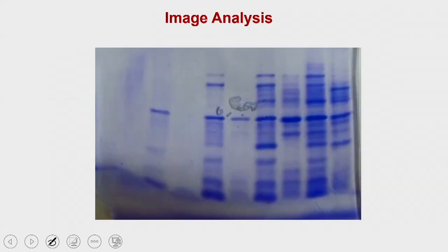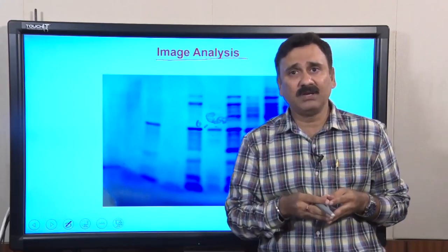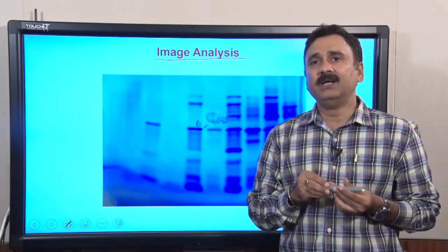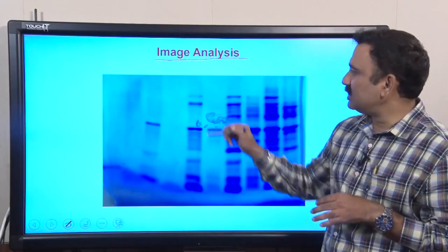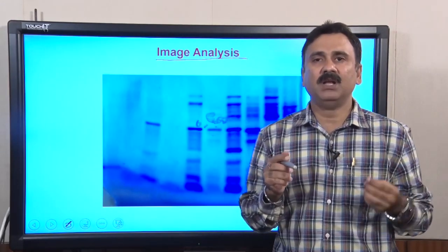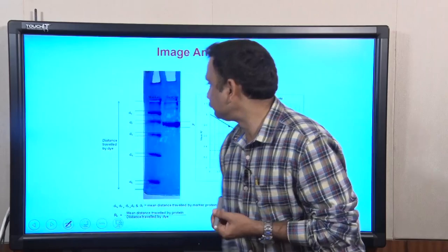Once you see a pattern, you are going to see an image. This image actually has a lot of information. It has information in terms of how many bands are present, what is the position of these bands, and what is the concentration or amount of this protein present. But this image analysis is also very complicated, and that's why it requires different types of software, because every image has a lot of information, and processing this information requires sophisticated software.